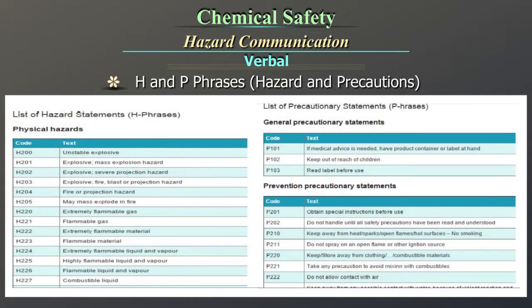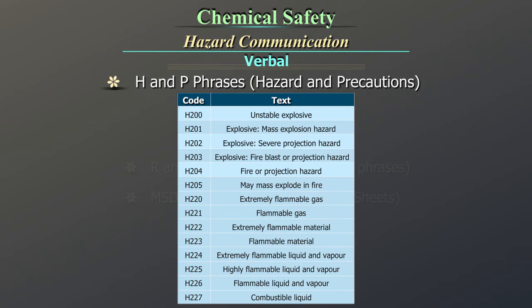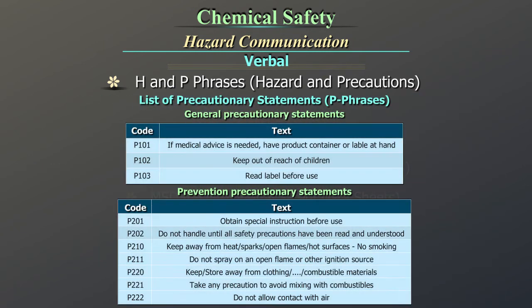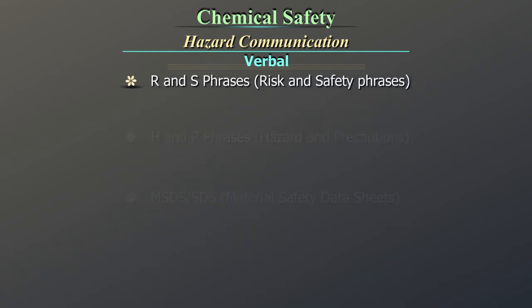H and P phrases — hazard and precautions. Now we can look at some H and P phrases, which are part of GHS. The list of H hazard phrases — H200 to H227 — shows the code with its explanation. For example, H200 indicates 'unstable explosive.' Similarly, there is a list of P phrases which are general and prevention precautionary statements. For example, P102 in general precautionary statements indicates 'Keep out of reach of children,' and P201 in prevention precautionary statements indicates 'Obtain special instructions before use.'